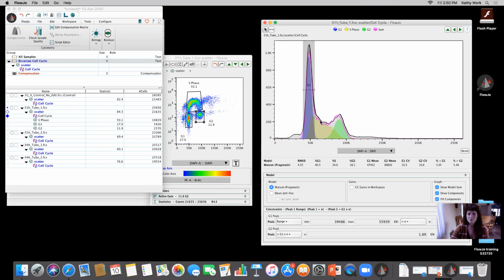Yeah, so I have a question here. The person is saying, maybe this is a stupid and not technical question regarding the proliferation analysis. Yeah, exactly, there's no stupid question. Regarding the proliferation analysis, why do divided cells display multiple peaks? Is it because the dye is only in the parent cells and the concentration of the dye gets diluted every time the cells split?